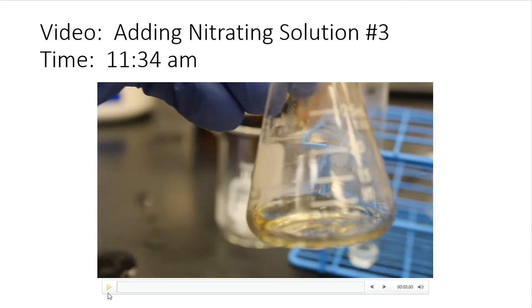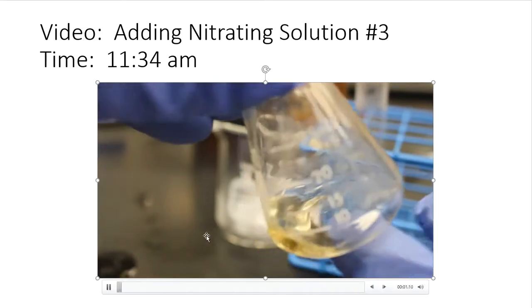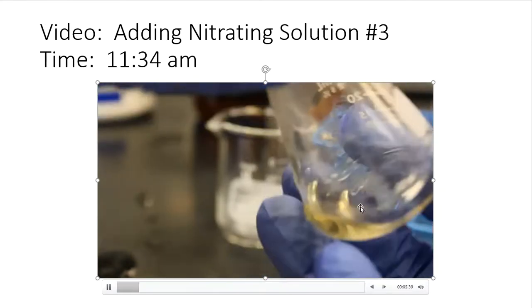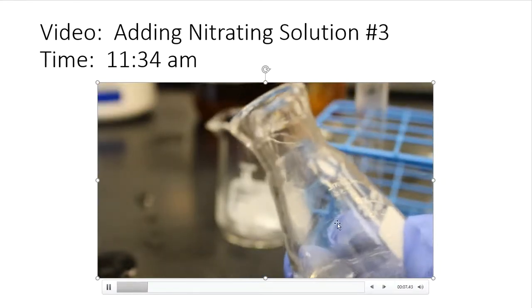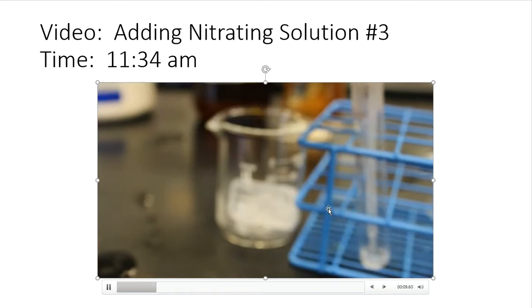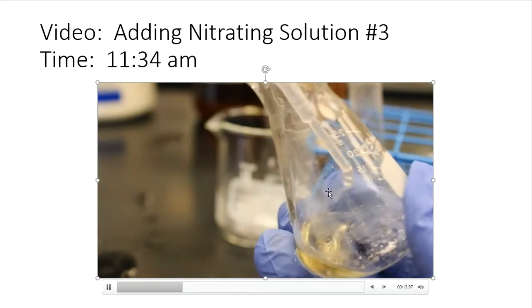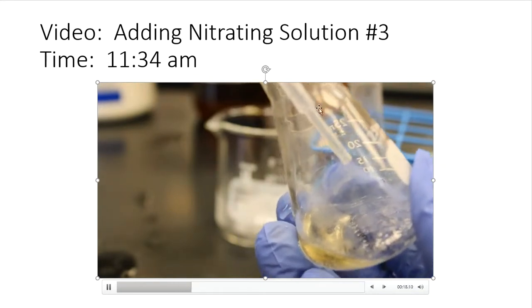All right, and then finally, I'll go to adding the nitrating solution to number 3. This was my liquid methyl benzoate that we started with in the very beginning. All right, so there's my methyl benzoate in the flask, and I'm getting ready to add the nitrating solution to it. So, again, pay attention, write down some observations. They're probably going to be asked on the sheet, and let's see what happens together.